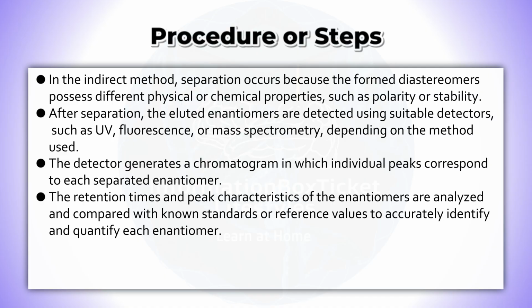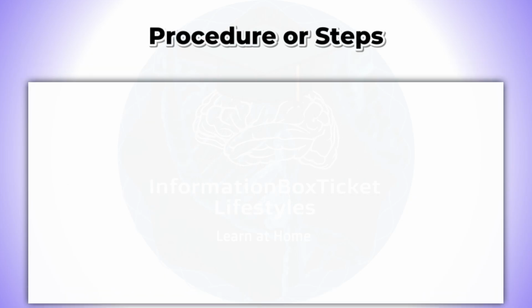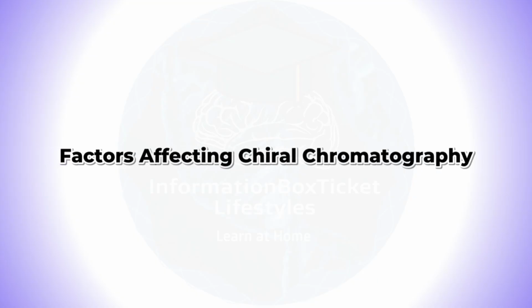The retention times and peak characteristics of the enantiomers are analyzed and compared with known standards or reference values to accurately identify and quantify each enantiomer. Factors affecting chiral chromatography.